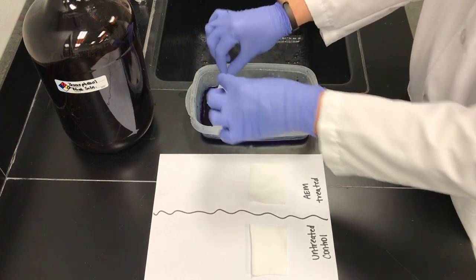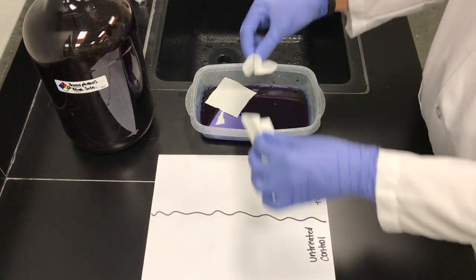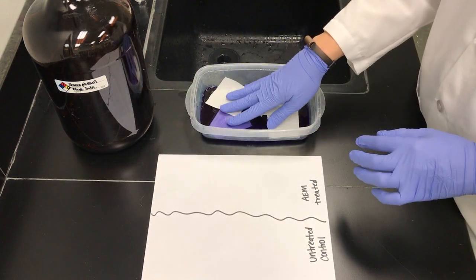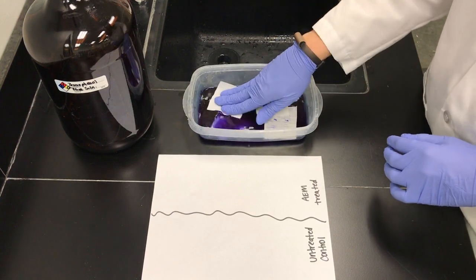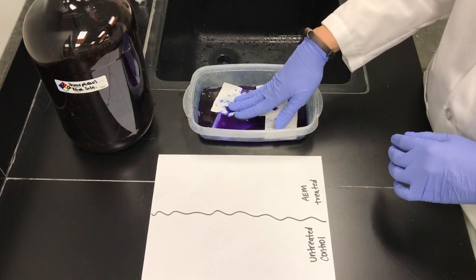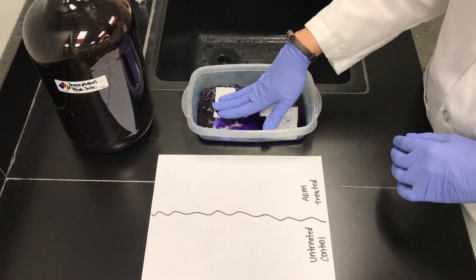Soak the samples directly in the BPB. Some samples will need to soak upwards to 20 minutes, but most will show some staining in less than one minute. One could agitate the sample to help wet the sample out.